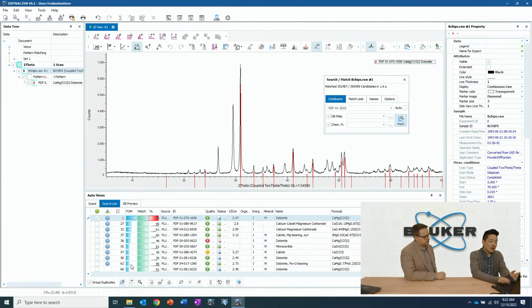So one of the things that you can do is apply what's called a residue. A residue basically takes all the identified peaks and snips them out and says, I know what you are, I want you to search versus whatever you haven't identified yet. I've accounted for all of those fingerprints, digitally removed them from the glass. So we have to go in and cut them all out individually? No, there's actually this awesome little thing called auto residue.